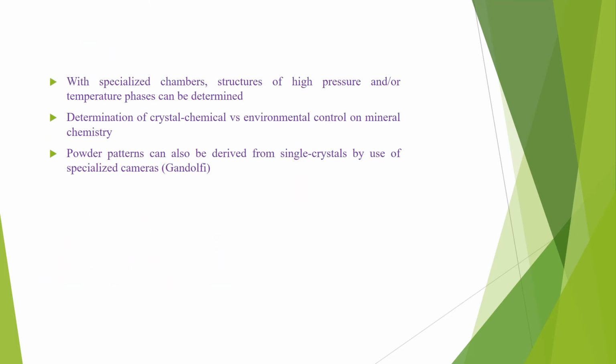Dear student, there are some other applications of single crystal X-ray diffraction technique. By using this technique, if we have some specialized chambers, the structure of high pressure and or low temperature phases can be determined.